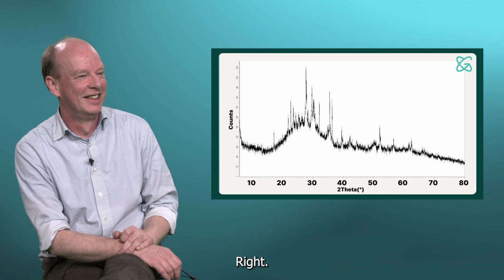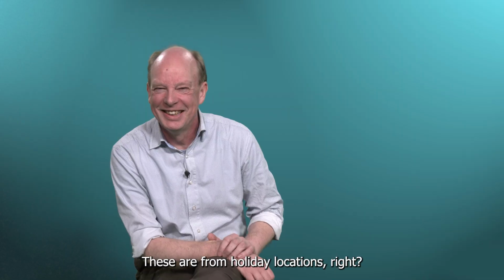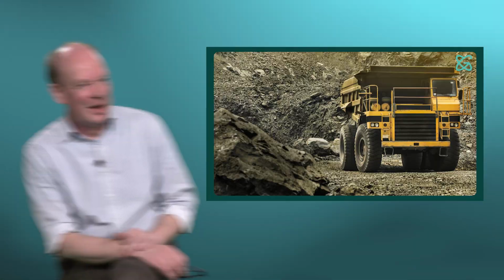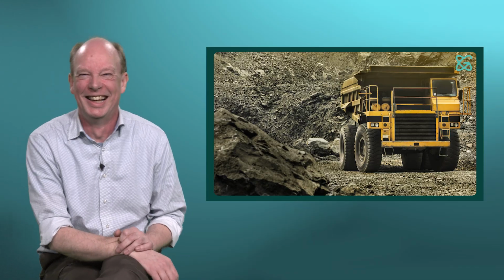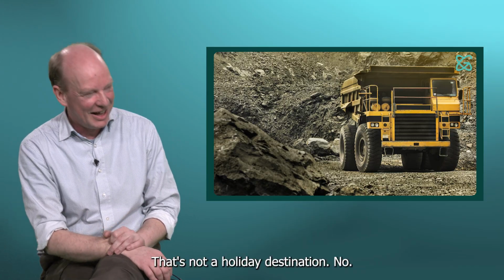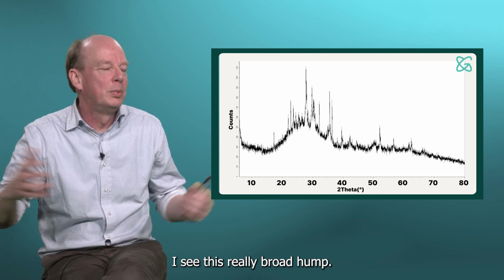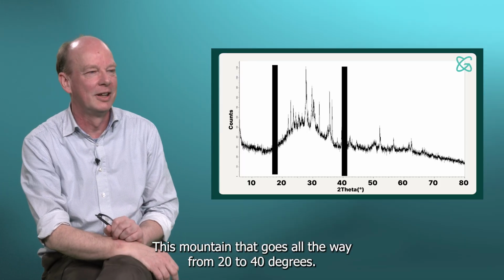Right. That's interesting. These are from holiday locations, right? You haven't shown me a material from an industrial slag heap or something like that, right? That's not a holiday destination. Now, I see this really broad hump, this mountain that goes all the way from 20 to 40 degrees.